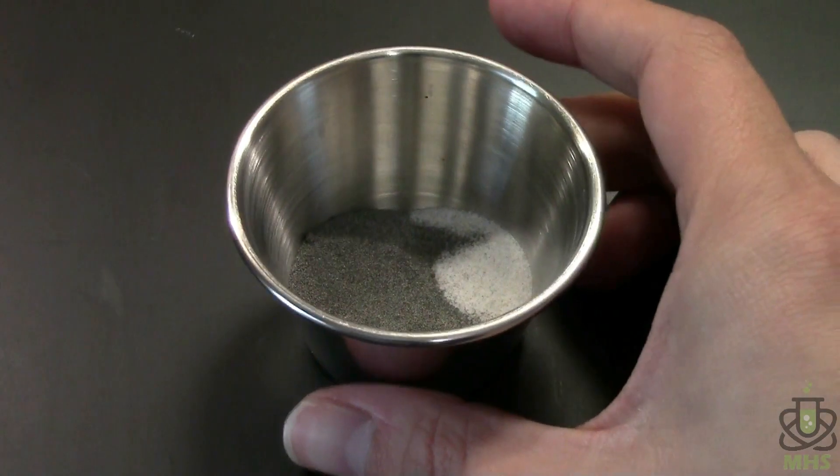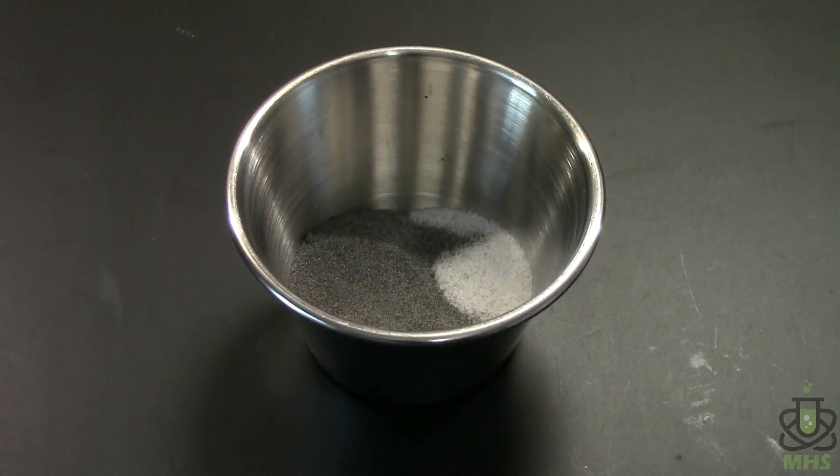I'm using a stainless steel condiment cup from Walmart as a metal crucible this time instead of a graphite crucible, again for purity reasons — any contamination from the stainless steel can be taken care of in the acid step at the end. I need to mix these together thoroughly and then take them outside and put them in the furnace.